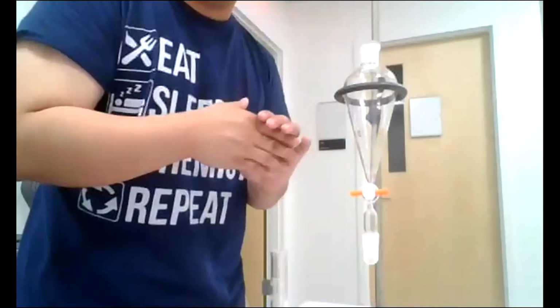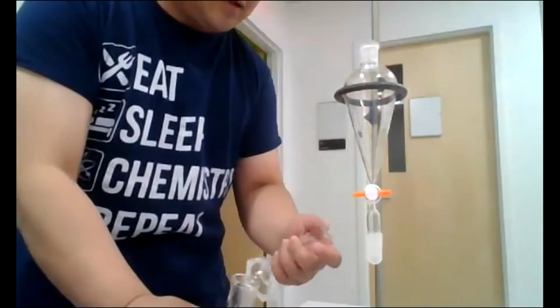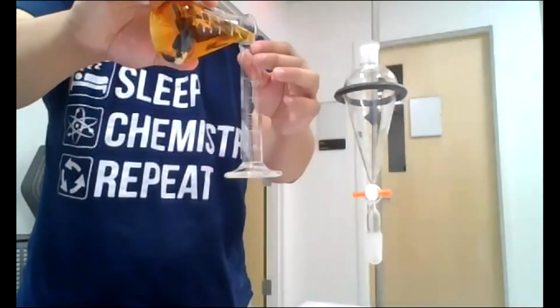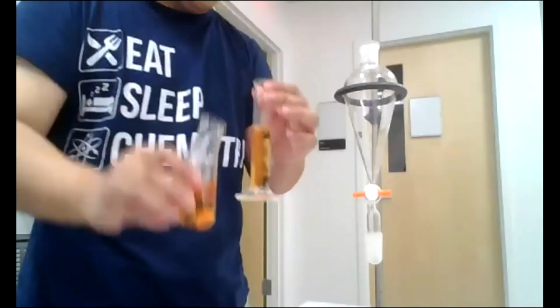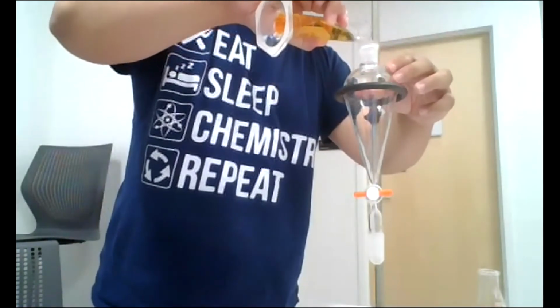The glass-to-glass joint should be good enough to keep the liquid within the separatory funnel. I'm going to pour out 20 milliliters into a graduated cylinder. It doesn't have to be exact. And my stopcock is closed.